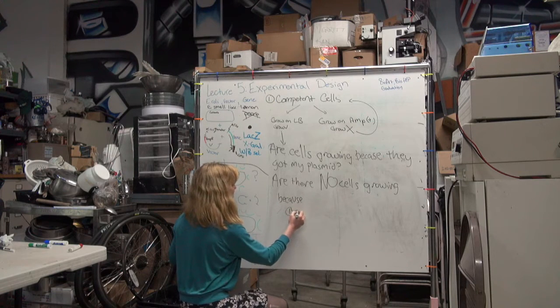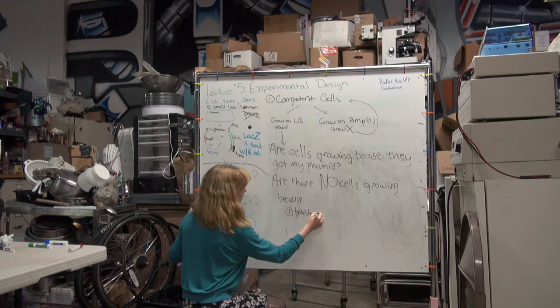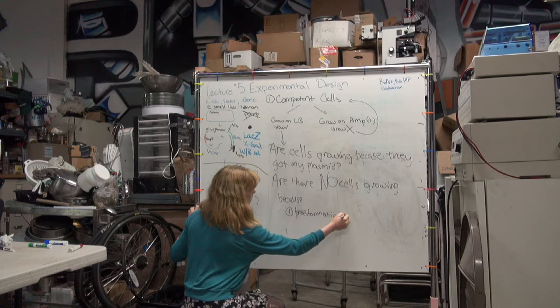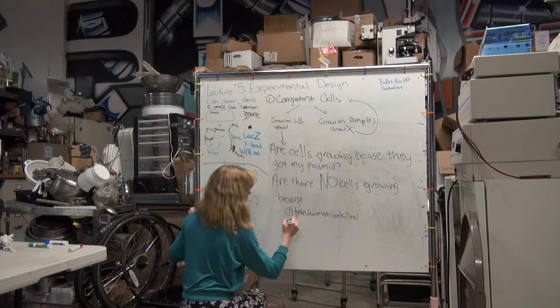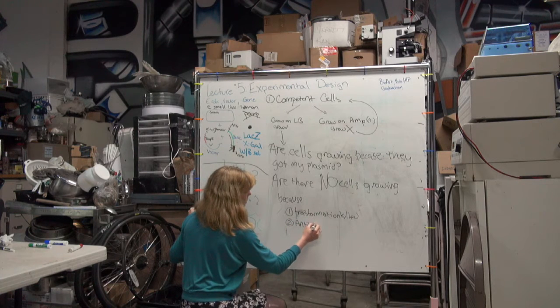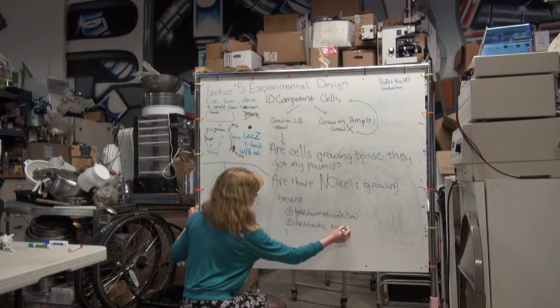One, the protocol, the transformation killed them. Two, the antibiotic resistance is not present, or the antibiotic is too strong.